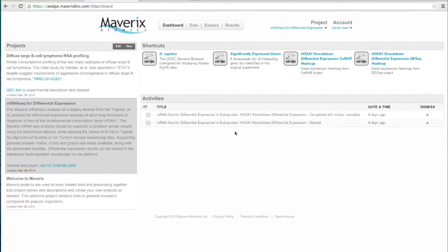The activities are notifications from the platform. So those are things like a notification that you've started an analysis, as well as when that analysis is complete, so that if you were to log back into your account and come straight to the dashboard, you would know immediately that you had a complete analysis and could start analyzing those different outputs.